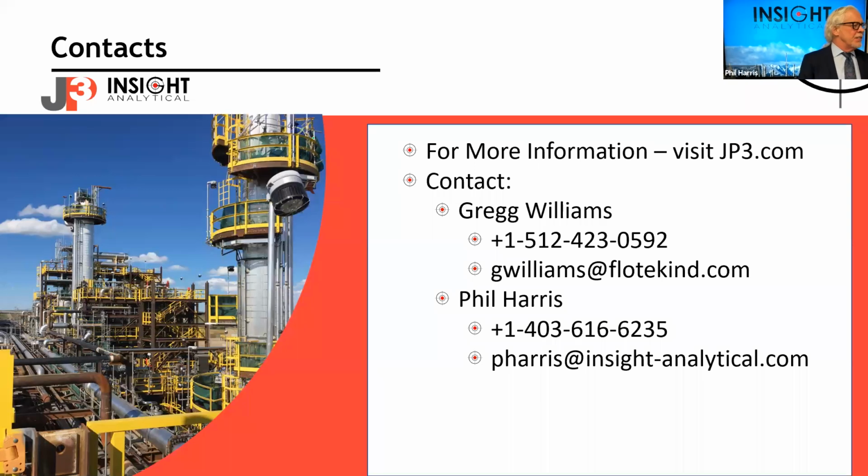Paul, I didn't see you sneak into the room, but I see you asked a question as well. So yeah, Paul's asked about, do we need a pressurized gas cell for gas applications? Most of the gas applications that JP3 has been done under pressure.